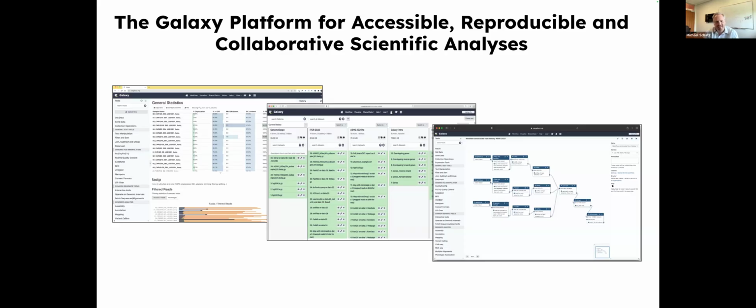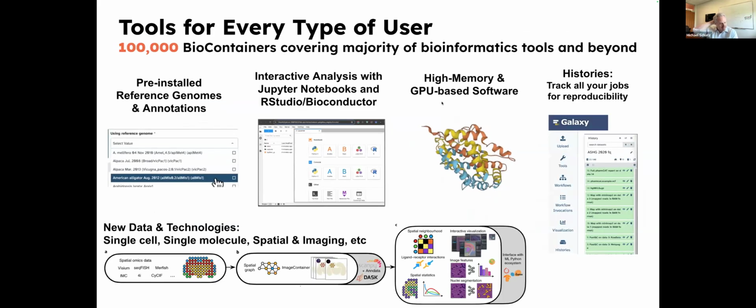So there's questions about p-values and t-tests. You betcha. Any sort of standard statistical analysis like that, you betcha. We have very rich support for that. There's more than 10,000 tools available. There's thousands of workflows available. There's all kinds of sophisticated processing that can take place. If you need to do custom stats in a notebook type of thing, you betcha. We can also support that. There's a lot of depth there. Realistically, today we're just going to go through 1% of Galaxy, give you a little taste, but there's a lot of sophisticated processing on the back end.